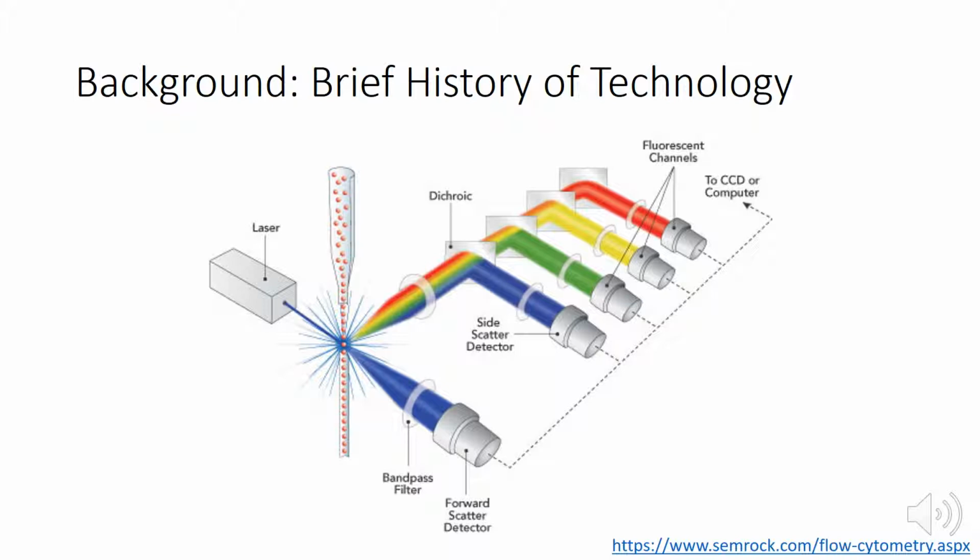The forward scattered light is detected by the forward scatter detector and potentially the fluorescent detectors as well, depending on the sample type. The side detectors also recognize the scattered light and record the voltage from the cell or particle. The output data generally looks like populations of cell types or particle types, with the axes of the graph providing information about characteristics of the distinguished cells or particles.